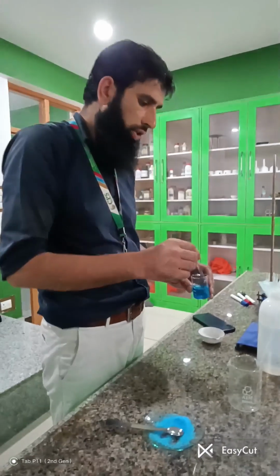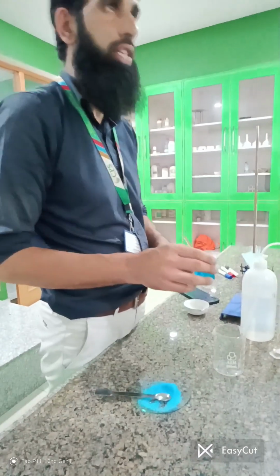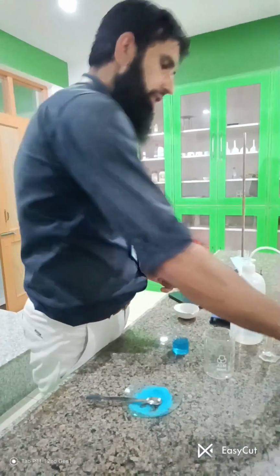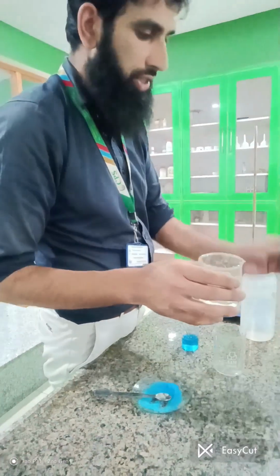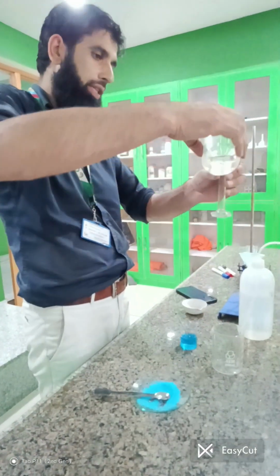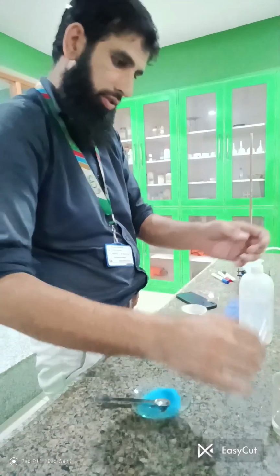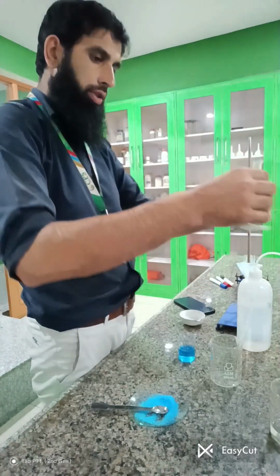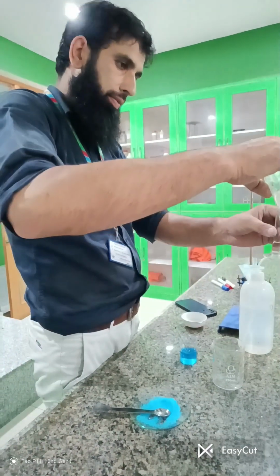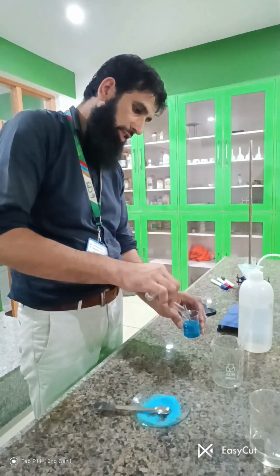After that, what will we do? We have to add 3 to 4 ml of dilute sulfuric acid to it. This is sulfuric acid that I have made dilute by adding some water, and this is the measuring cylinder. I will take 2 to 3 mLs. Yes, 2, 3 ml. And I will add the sulfuric acid.